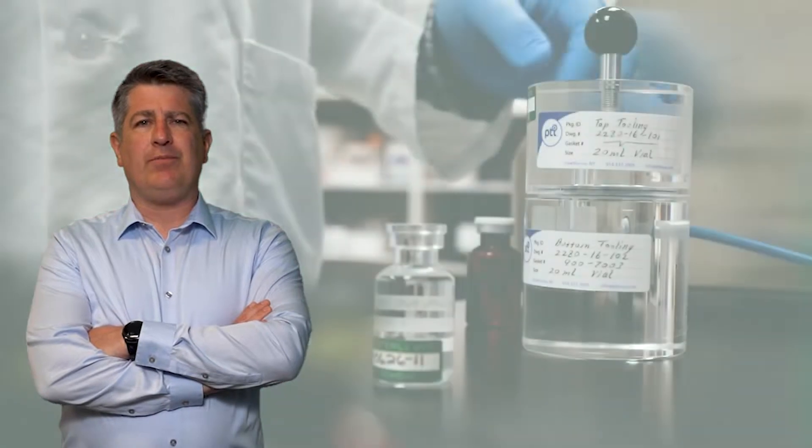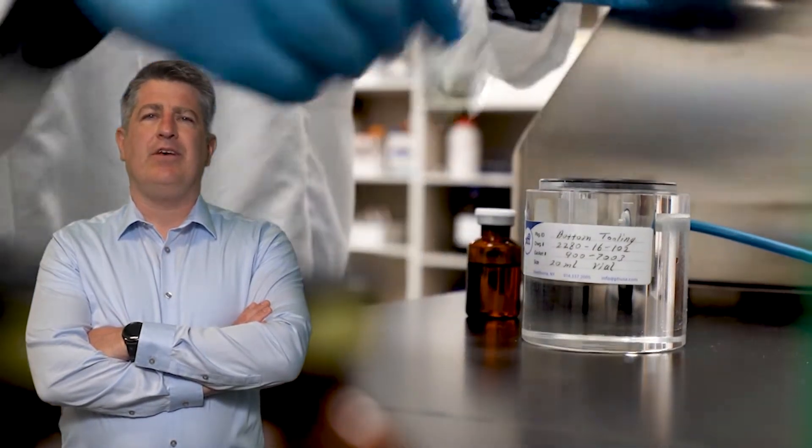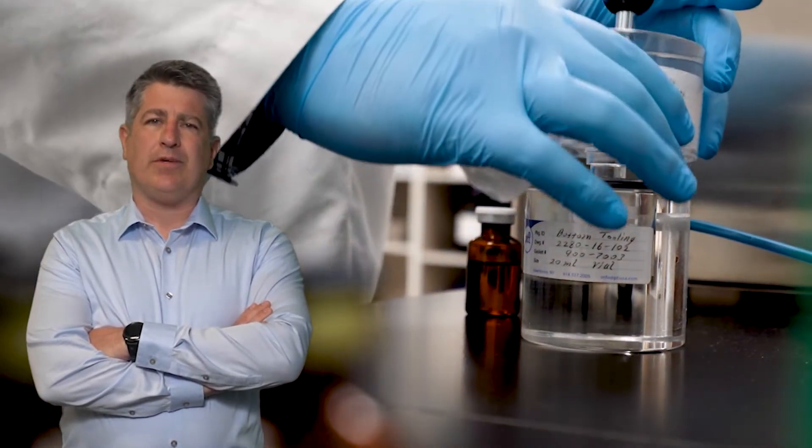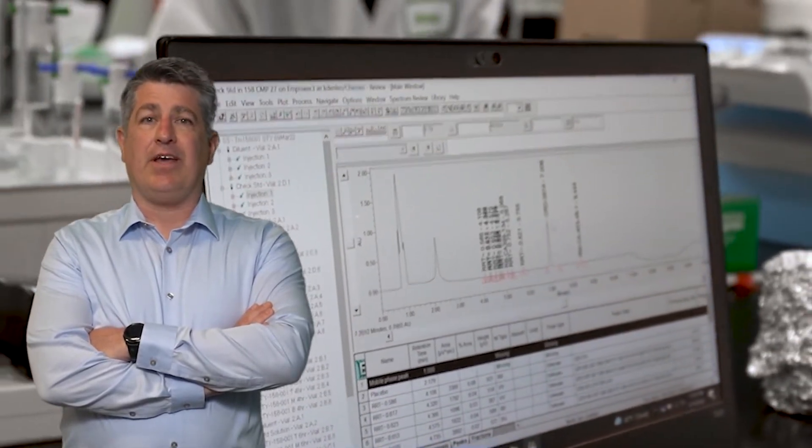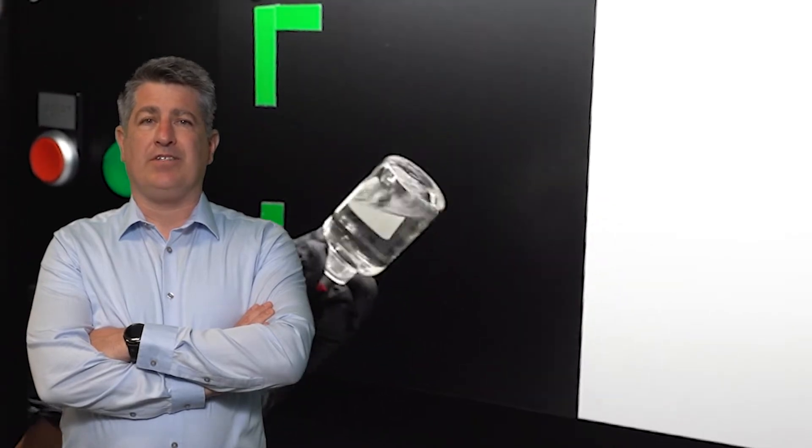Hi, I'm Devin Wiginton, the Vice President of Quality Control. I oversee all the tests we perform at BSM. I've been on the BSM team for five years. All the treatments we make must undergo testing to ensure it meets all of our requirements, such as having the right concentration of drug, being at the correct pH, and ensuring the drug is properly sealed.